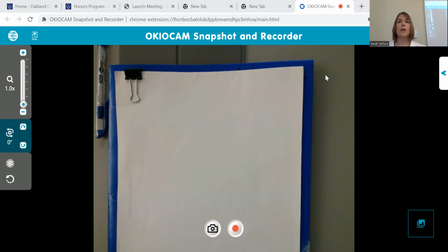It pulls together the nitrogen rule, the hydrogen rule, the rule of 13, and lots of the different guidelines that you can see videos about, each one in particular. I put it together in a 6-step process based on what I learned in graduate school and my attempt to make it as smooth as possible for students as well.